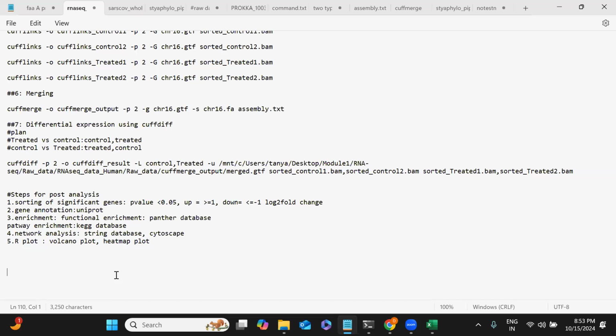Yes, I wish that the R plot is also included. Jezreel, we are left with only 4 days in the workshop, and in our session the R plot is not included. But sometimes people are very smart and pick up very quickly.